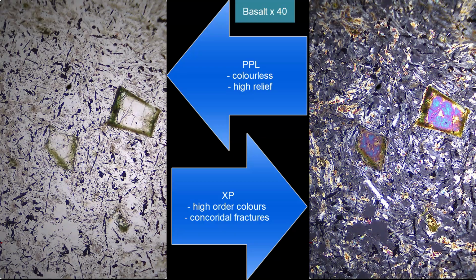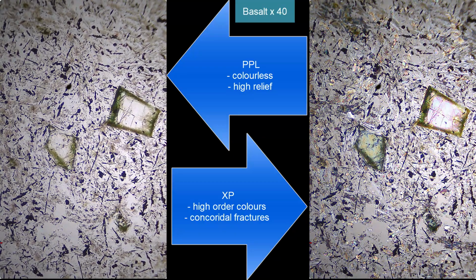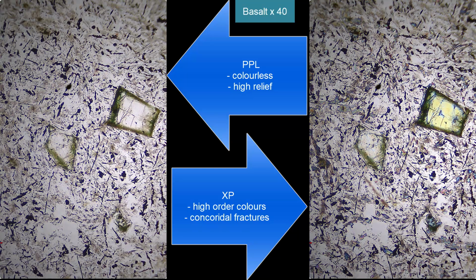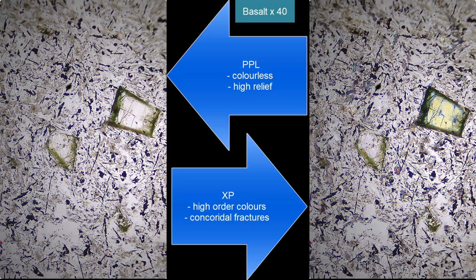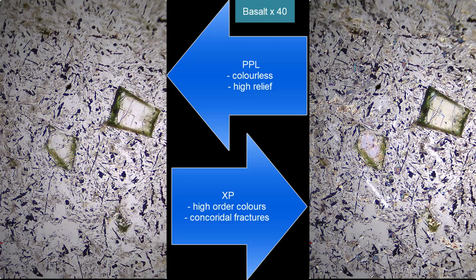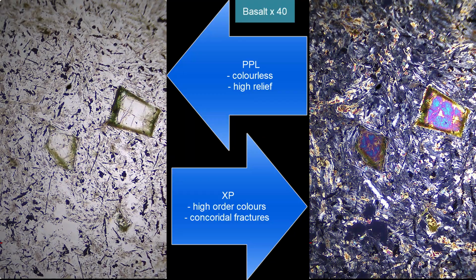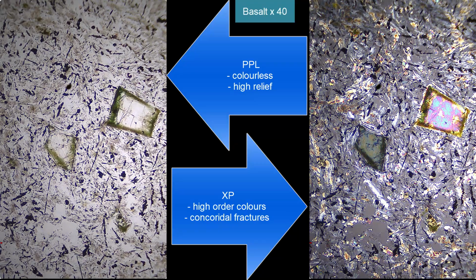So you can see some large olivine crystals though, which is unusual. The reason why you can't usually see these, I don't have pyroxenes and amphiboles and olivine, is because they're heavy and they sink and melt, so you just don't see them. So this must have formed and then got pulled up, so that's porphyritic a little bit. So you can see some larger olivine crystals. It's not normal, it's quite rare.